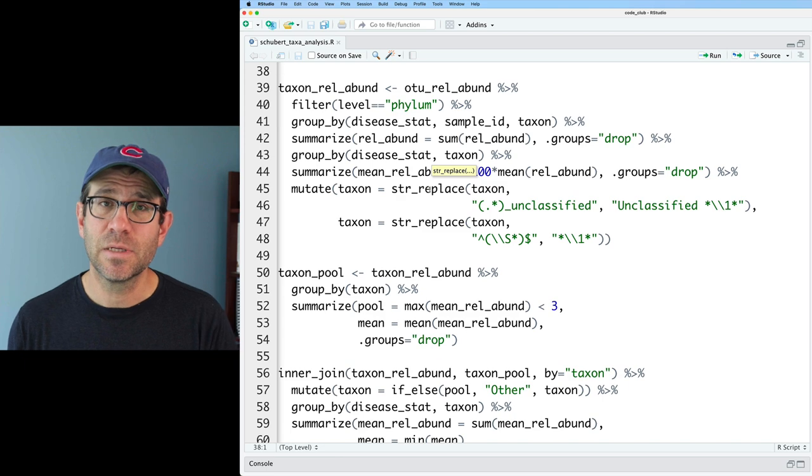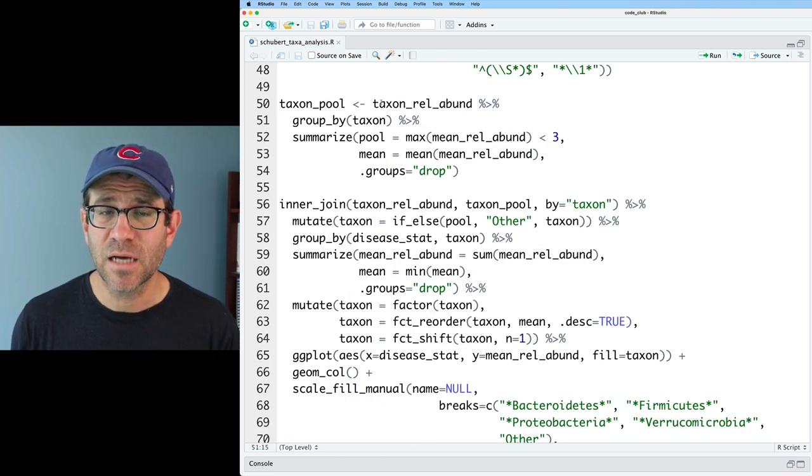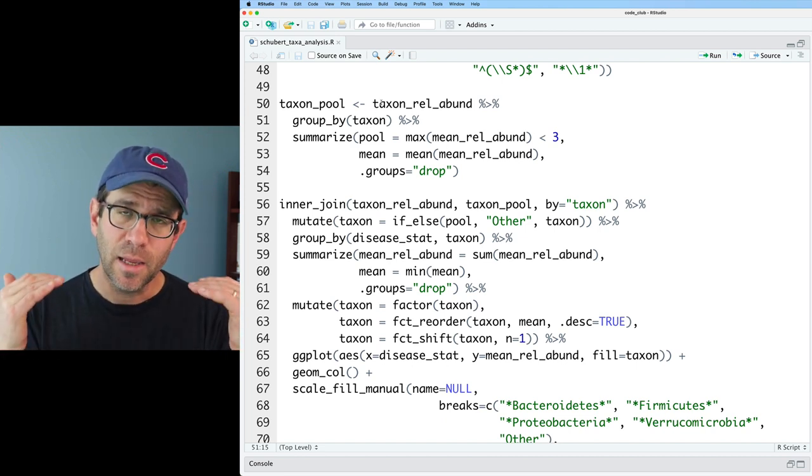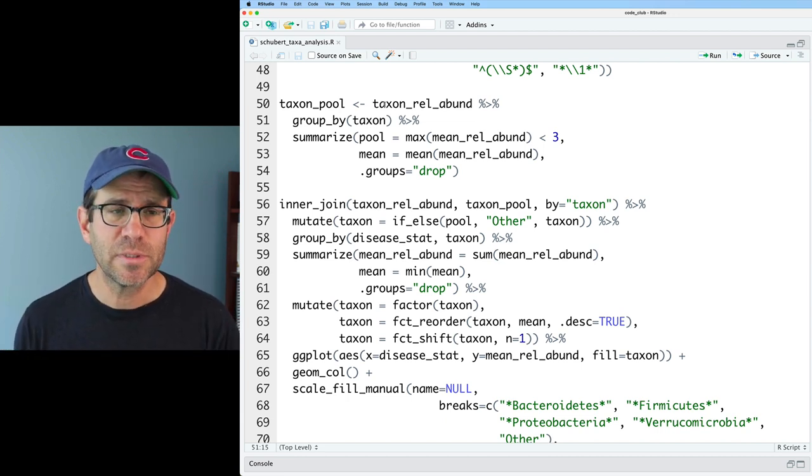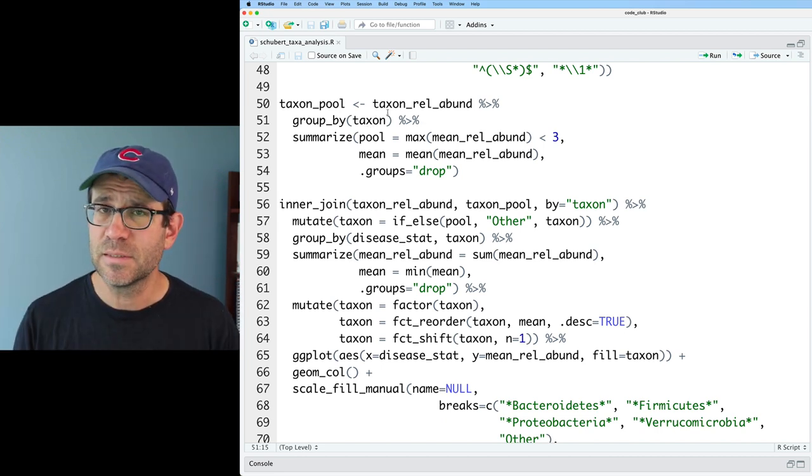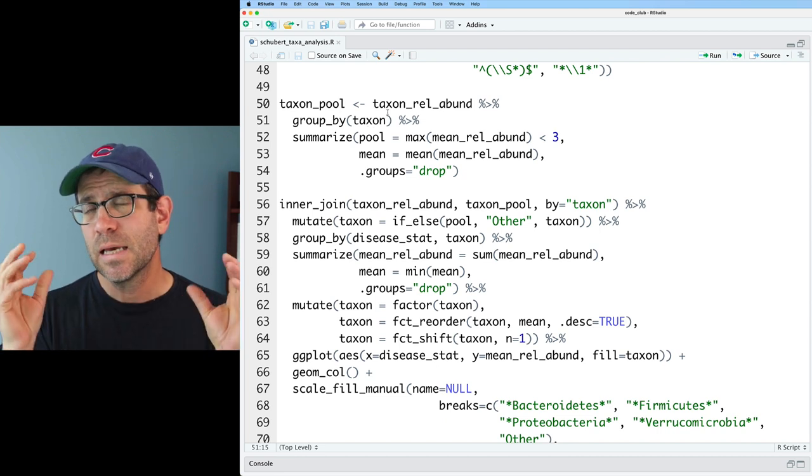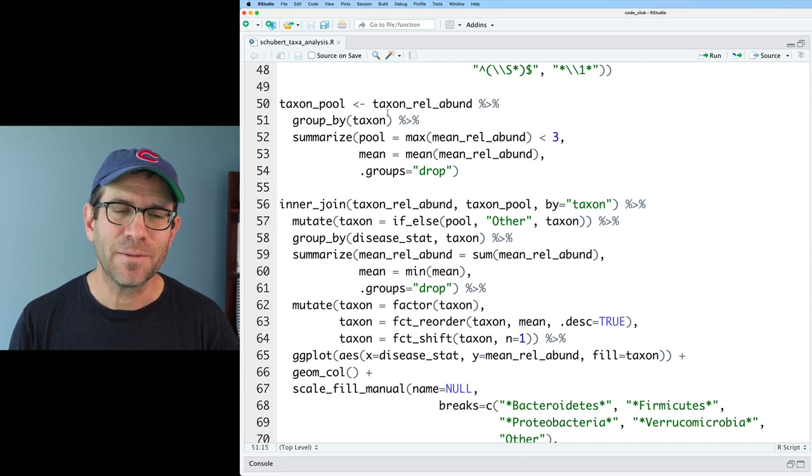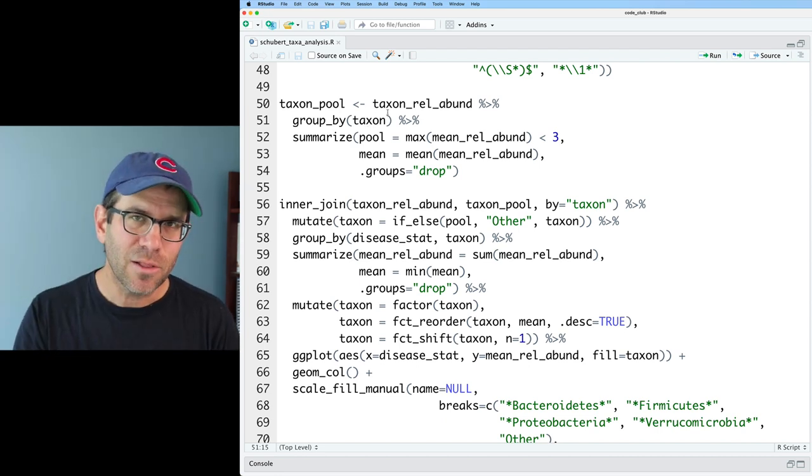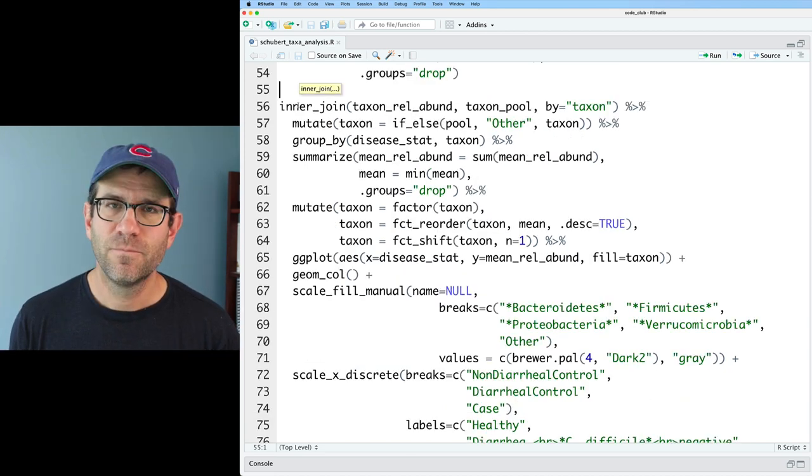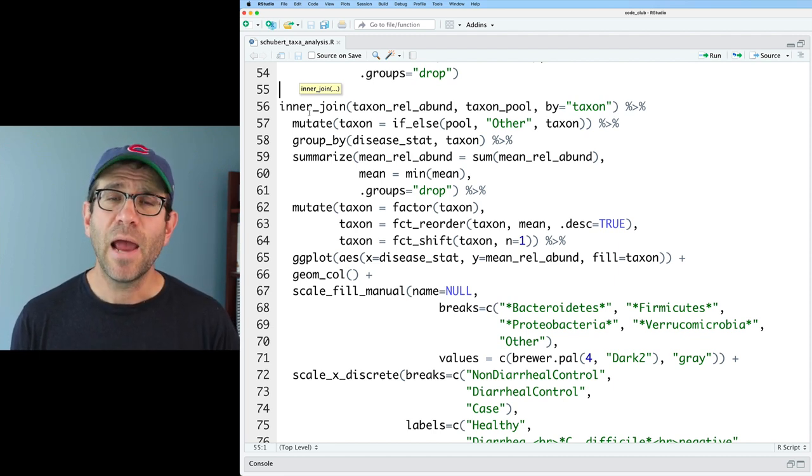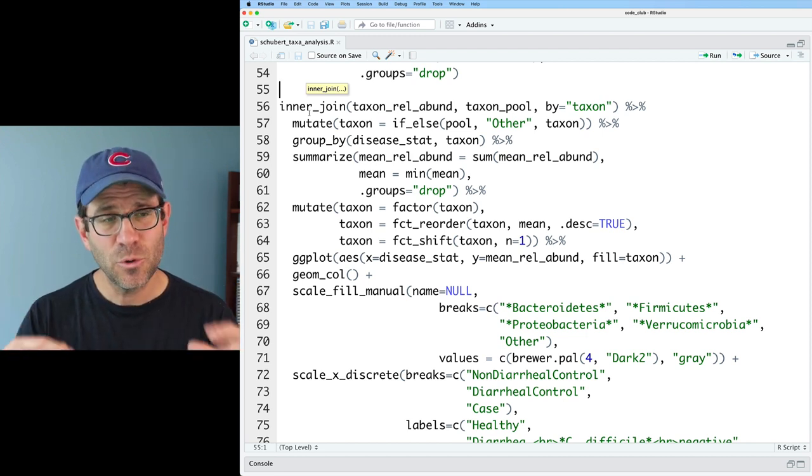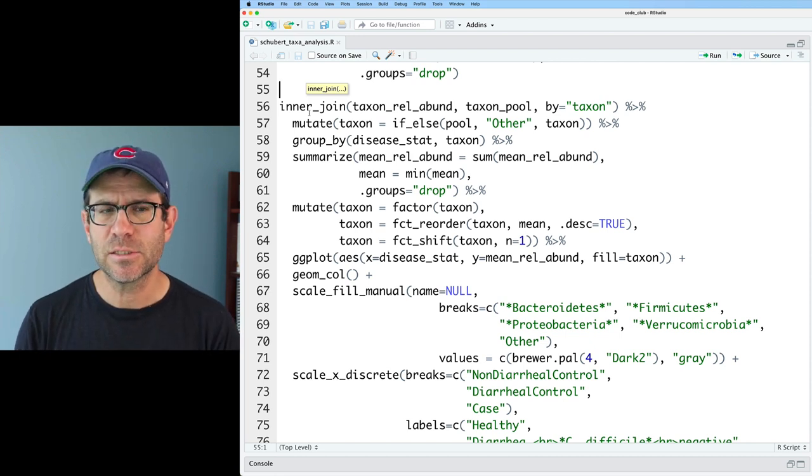And then we use str_replace to do some modifications on those phylum names so they look nice and we can italicize them using the functionality that we loaded from that ggtext library. We then create a variable taxon_pool where we're looking at what phyla occur at a level below three percent in all three of the disease status groups. If none of the phyla have an average relative abundance above three percent in any of the three disease status groups, we then pool them together. That's because in a lot of these visualizations, we can get these really thin slices, I call them shrapnel, taxonomic shrapnel, that you can't see but creates tons of colors in your legend. Finally, we do a join between our taxon relevant data frame and our taxon pool data frame and then use that information from the pool to tell group_by and summarize which phyla to pool together within each of the three disease status groups.